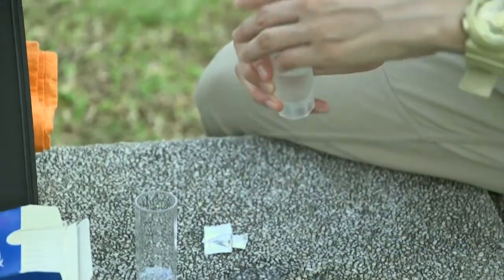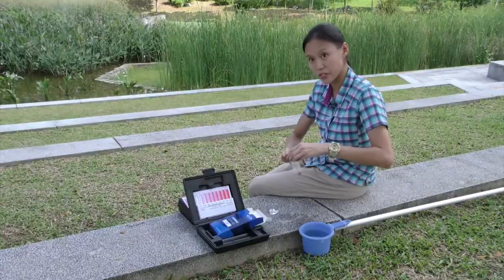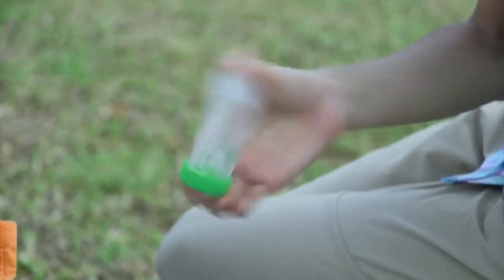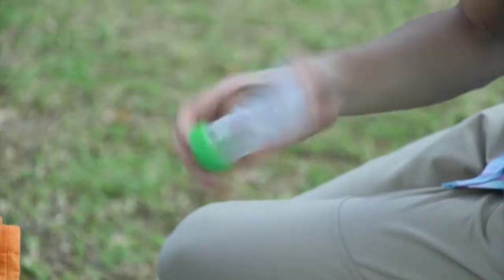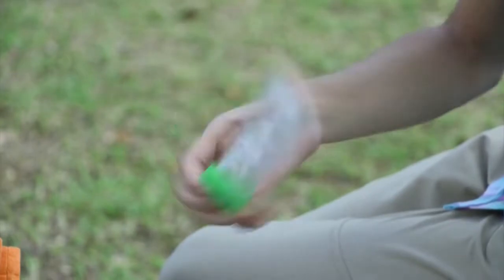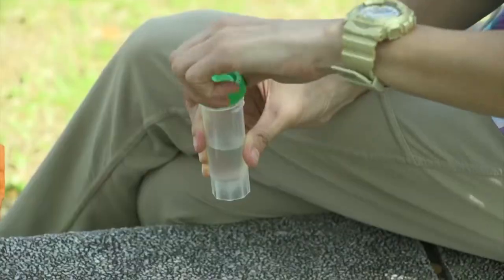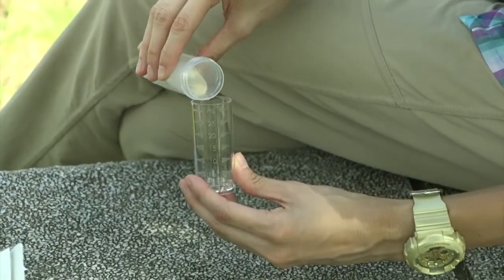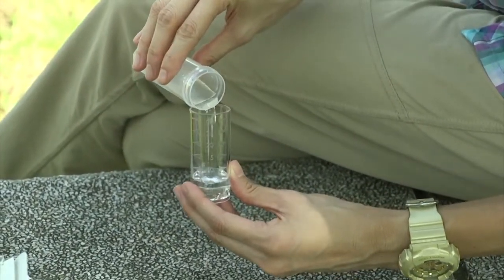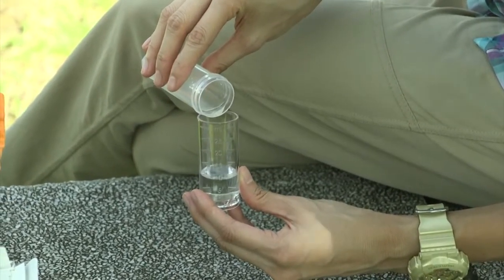Cap the reaction tube and shake vigorously for exactly 3 minutes. After this, allow the sample to sit for another 2 minutes. Pour 10 milliliters of the treated sample into the sample cup. Be careful not to transfer any of the cadmium particles over into the sample cup.